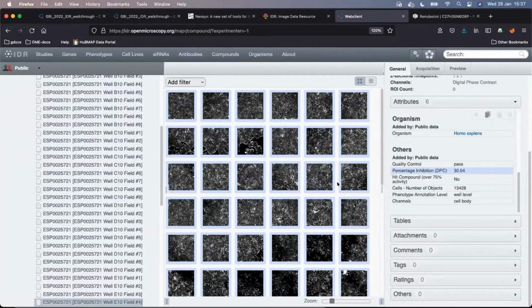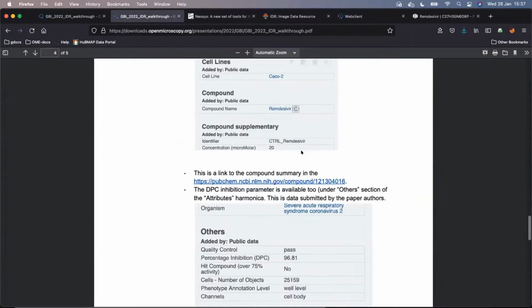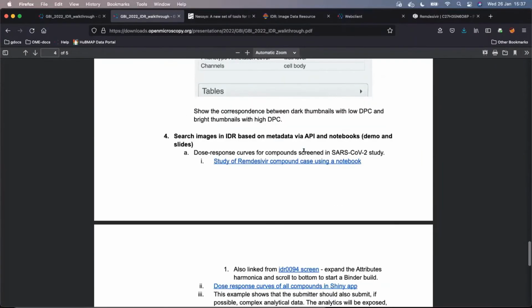I will just give you a hint, because now we are done with the user interface searches, and we are going into the searches which would be more elaborate by means of computational resources, but not by means of your effort, because Jean-Marie and the team put the effort there for you. So let's go for that. By this I mean that we will search using the API.